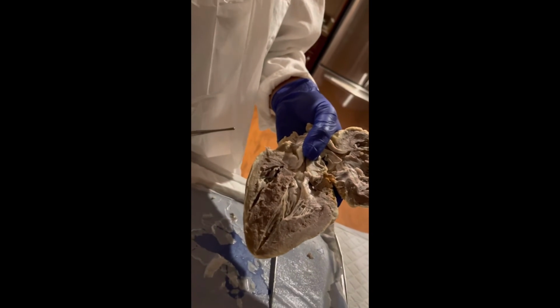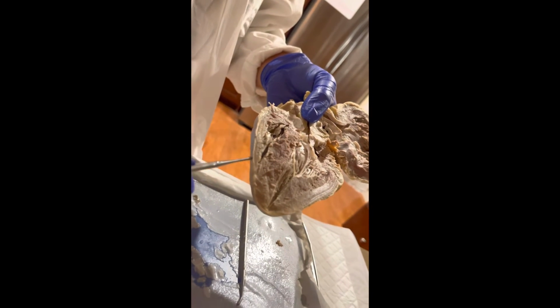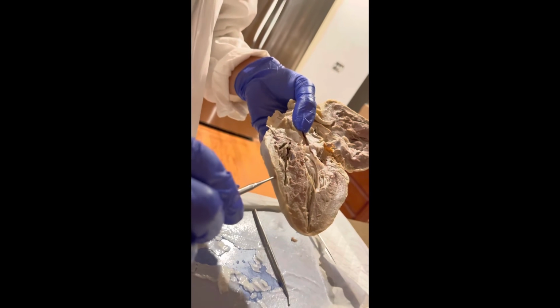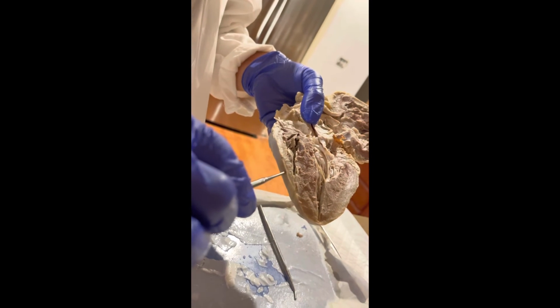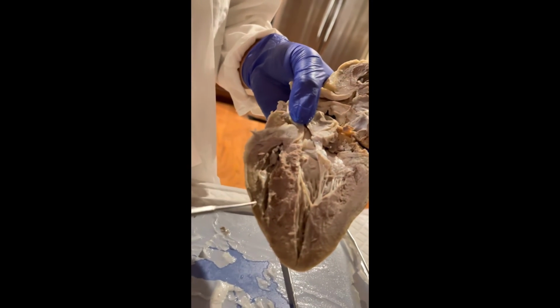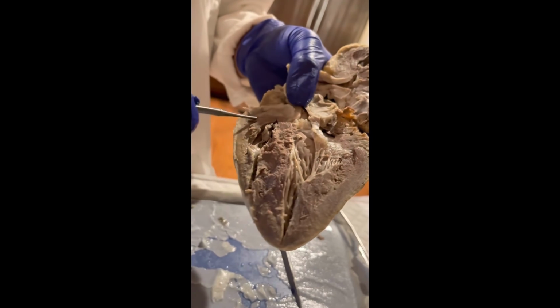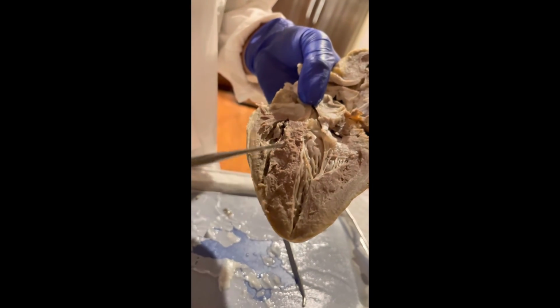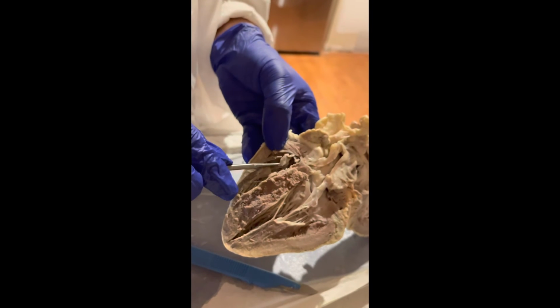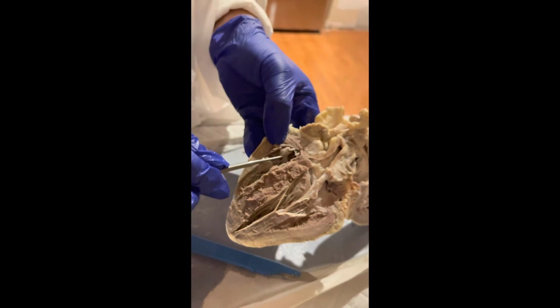Now we touch on the 3 layers of the sheep's heart. So just on the exterior portion here, this is considered the epicardium layer. It's a little thinner. Then we go a little deeper for the thicker layer, that is considered the myocardium. And the third layer inside is definitely much thinner. That is considered the endocardium layer.